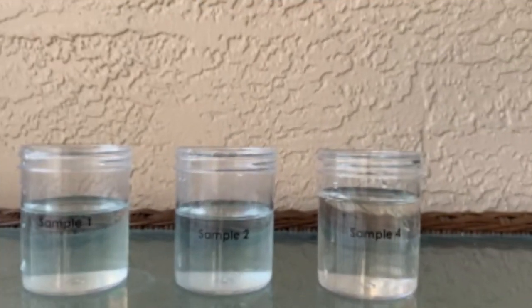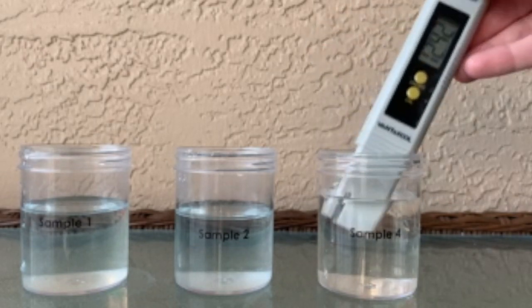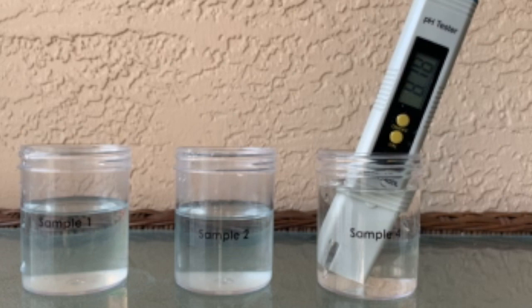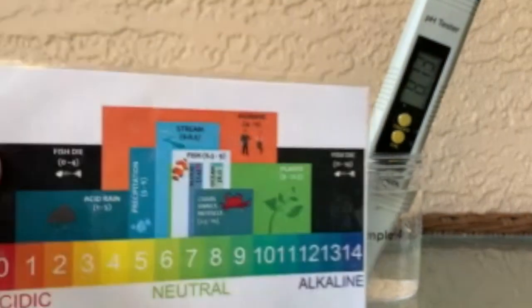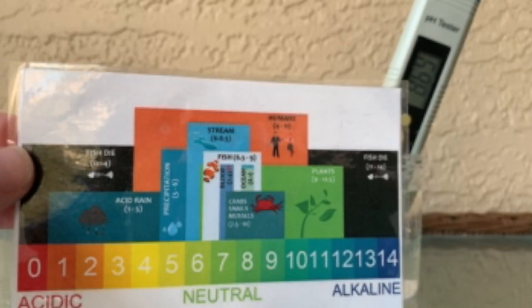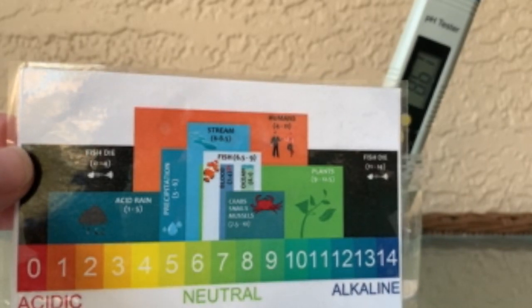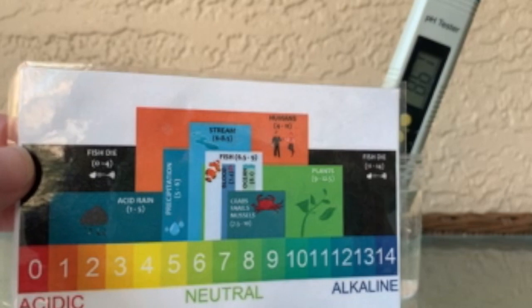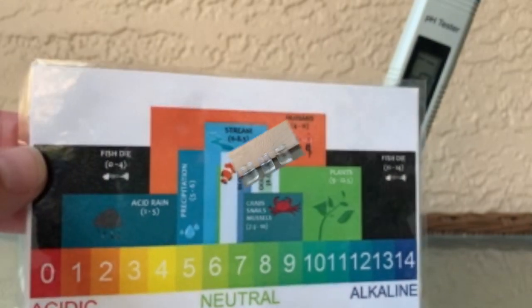And finally, we have sample four. We're going to test what the pH of this sample is. It looks like it's reading closer to 8.8 or 9, which is okay for some of our crabs and snails, but unfortunately it's a little bit too basic for our streams. Some of our animals that live in streams might not really like this freshwater environment and it might not be very safe for them.